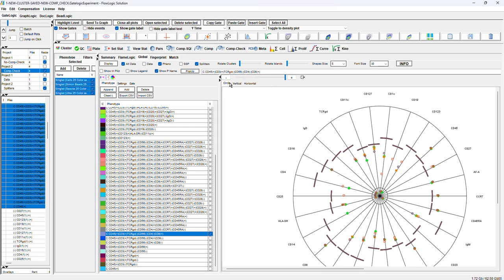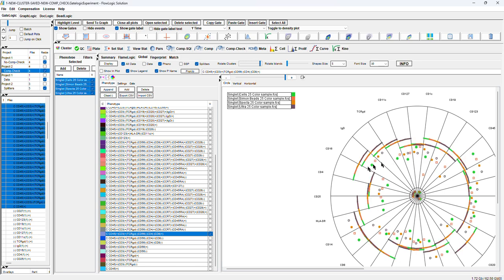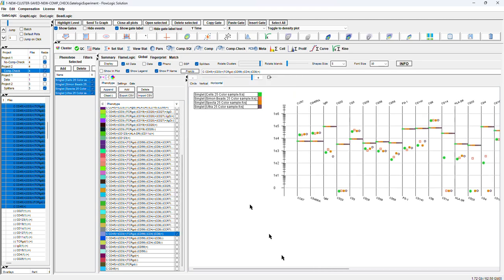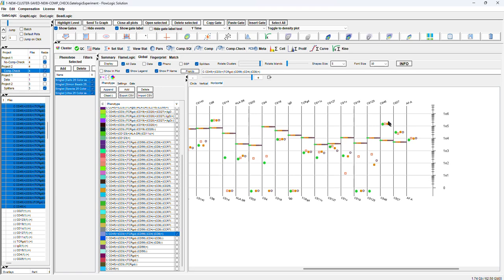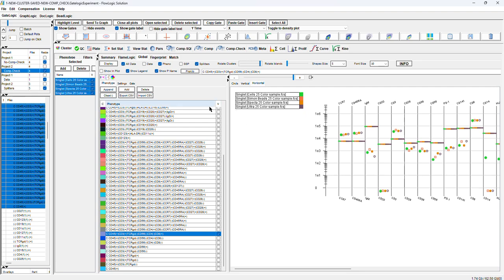We take the CD8 there. For the files, we can display the legend, so every one, and we can rotate, so we can really display the file. Now, probably the best is to use a horizontal display. Here we have all the parameters, and you can see where is the extraction of your phenotype.